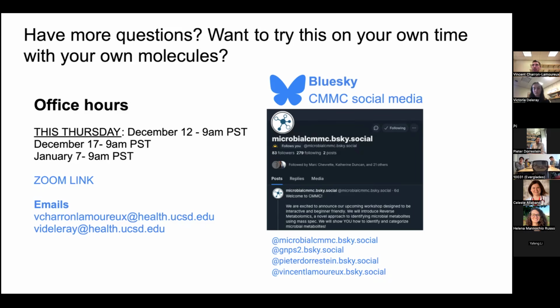We spent some time trying to harmonize this metadata. This is a postdoc, Yasin El-Biad, that did the harmonization. The type of things that we could really easily harmonize were disease states, organ distributions, and similar type of things. But there were a lot of things that were a bit more difficult to harmonize. And one of those was actually microbial taxa.